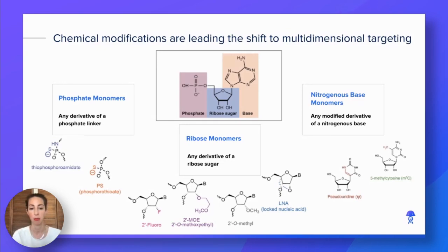Recently, the discoveries in these complex therapeutic categories, including siRNA, miRNA, and ASOs, have been remarkable for their ingenuity and efficacy. By combining the powers of biology and chemistry, RNA therapeutics are the primary drivers of the shift from one drug, one target to multidimensional and iterative targeting.